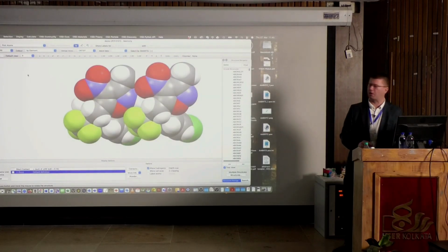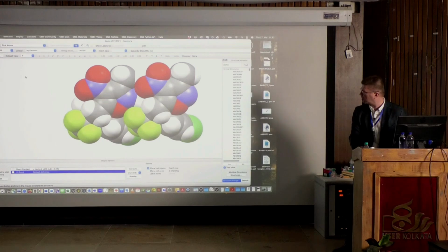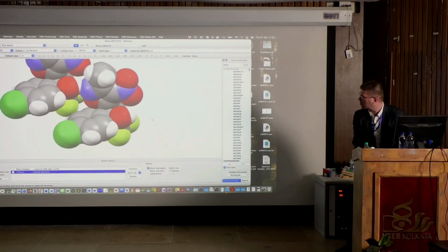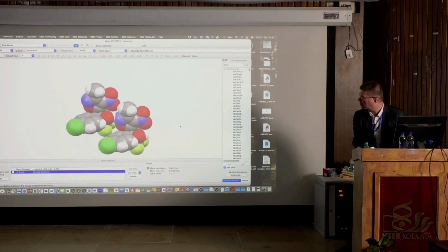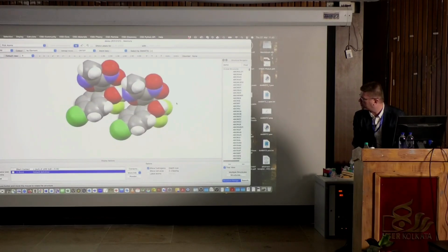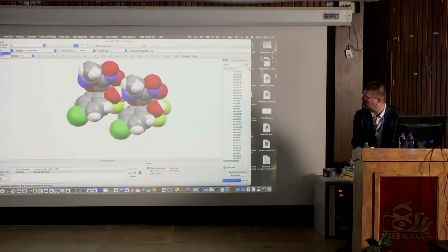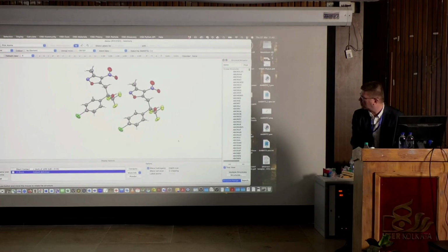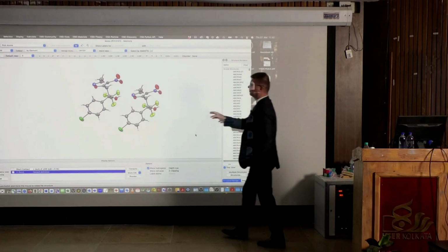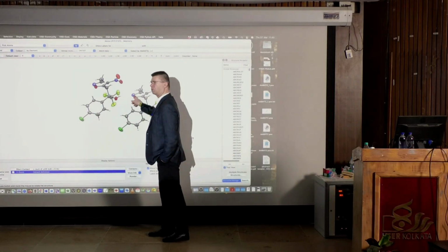And when I click space filling, now you see an interesting thing. I put it in this way, like this, let's go up a bit. Now I will change it back. We have a better orientation. Now I'm trying to put it nice, like this. So now look at this region. So the hydrogen bond is here.